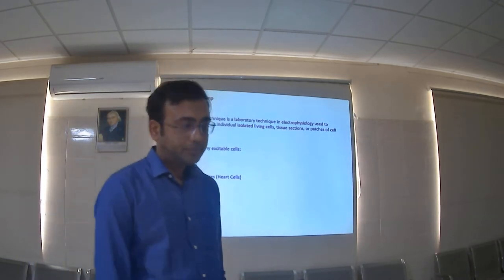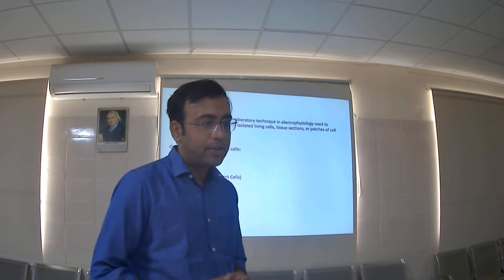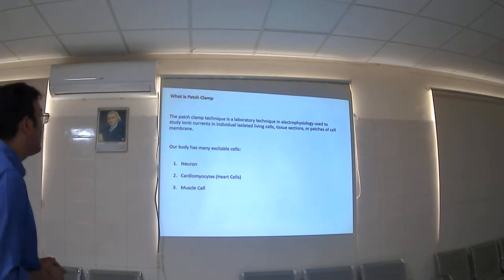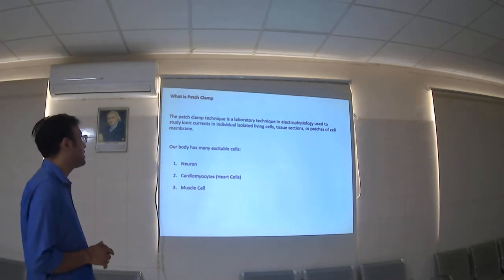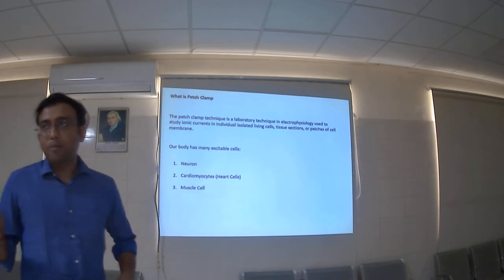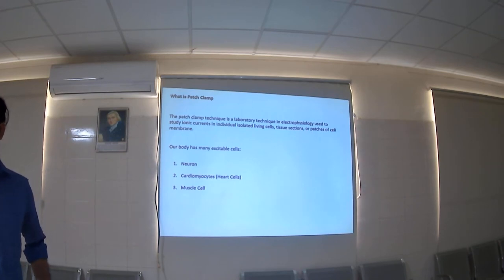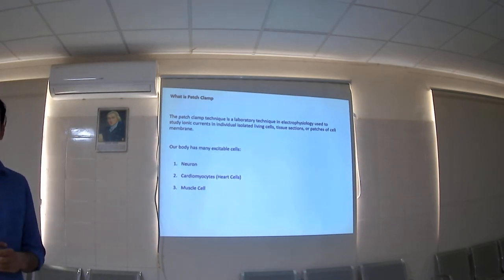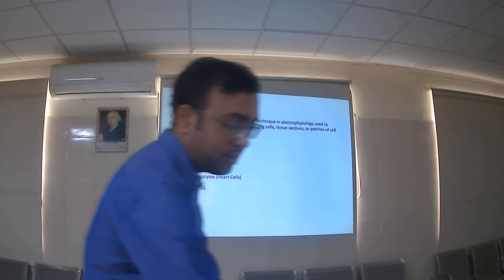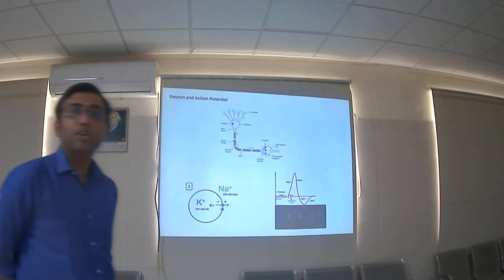So patch clamp technique is a laboratory technique in electrophysiology used to study ionic current in individual isolated living cells, tissue sections or patches of a cell membrane. Though there are different types, in our lecture we will discuss neuronal cells, how we use neuronal cells to study various electrophysiological properties, especially the ion channels, and why this is important in pharmacology and various techniques also. Okay, so you all are aware of neuronal structure.